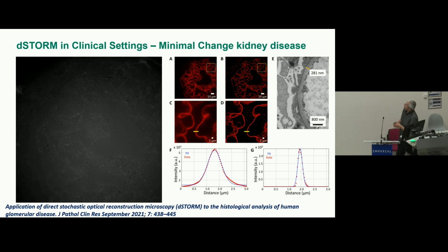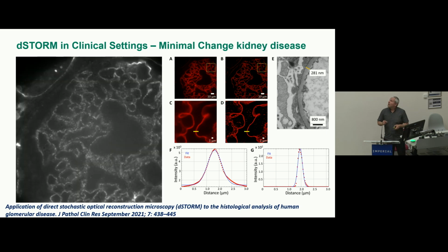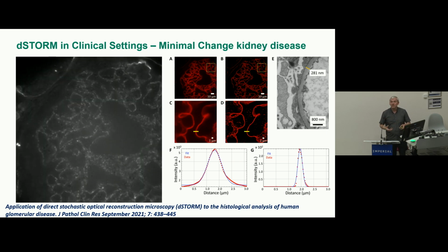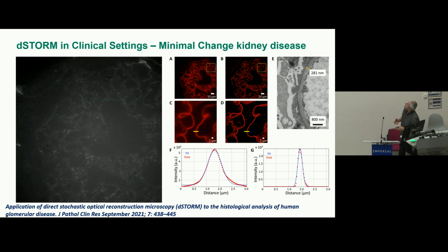Yeah, there it is. In kidney disease, you still need electron microscopy to stage different diseases. One of these is the diseases of the glomerulus. It looks more like a digital cauliflower. It's full of loops, but this is the way that the blood is converted into urine, and it could be attacked by immune complexes, antibodies, so immune diseases can generate this problem.